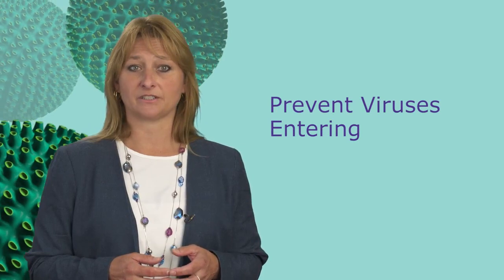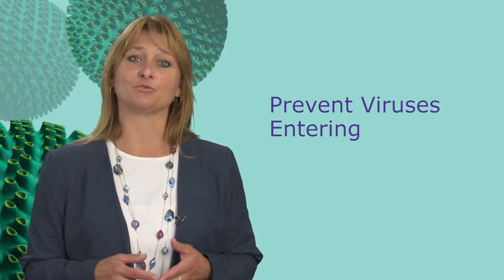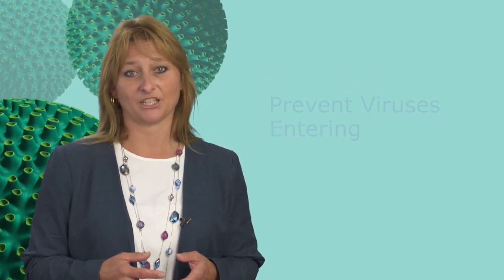Welcome to the Total Virus Safety video on virus contamination prevention in upstream processes. In this video, I will discuss ways to prevent viruses from entering your upstream processes and explain commonly used approaches to reduce the risk of bioreactor contamination.